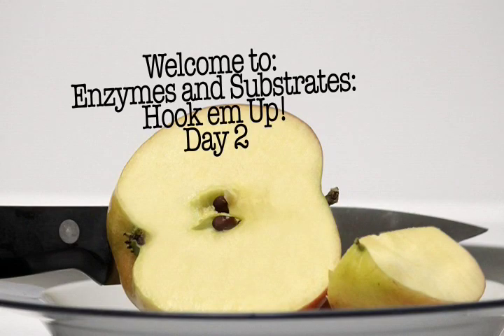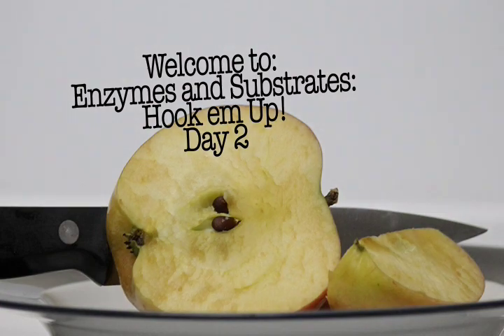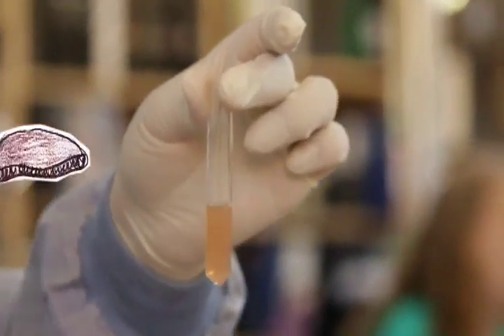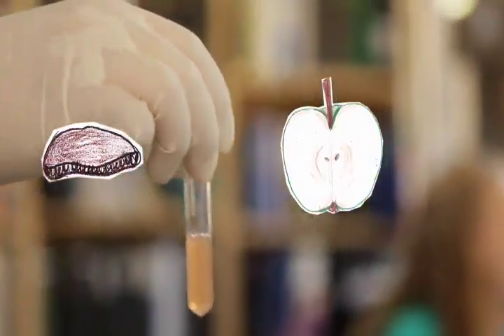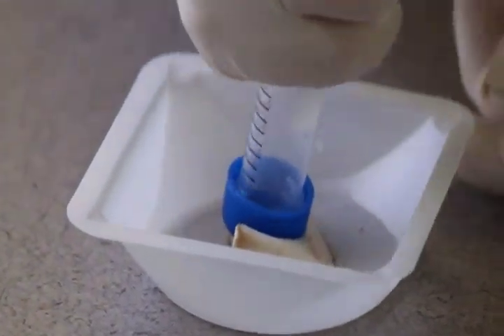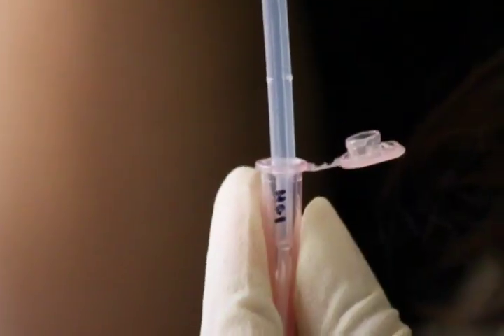Have you ever wondered why apples turn brown after leaving them cut open for too long? This is the day you will get to understand hands-on how enzymes work and how variables affect them. Today you will be examining the enzyme responsible for turning mushrooms and also apples brown, the tyrosinase enzyme. You will be grinding a portobello mushroom to extract this enzyme from it. You will then introduce variables that will affect the reactions.